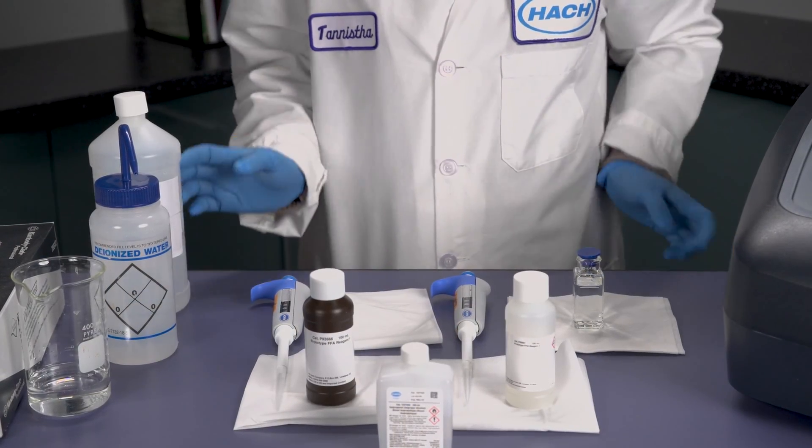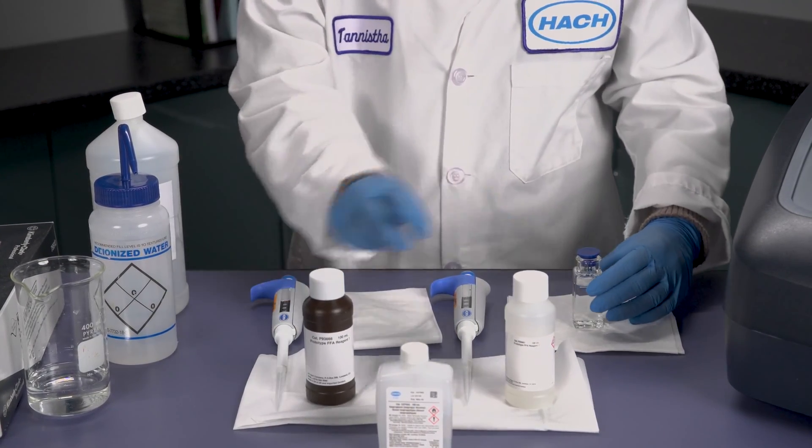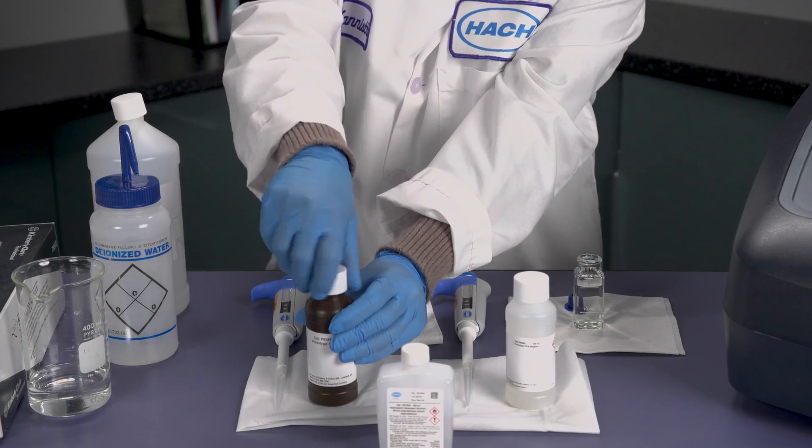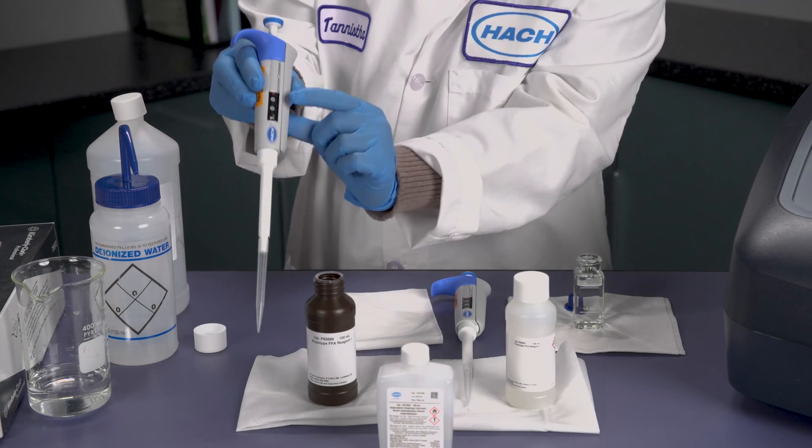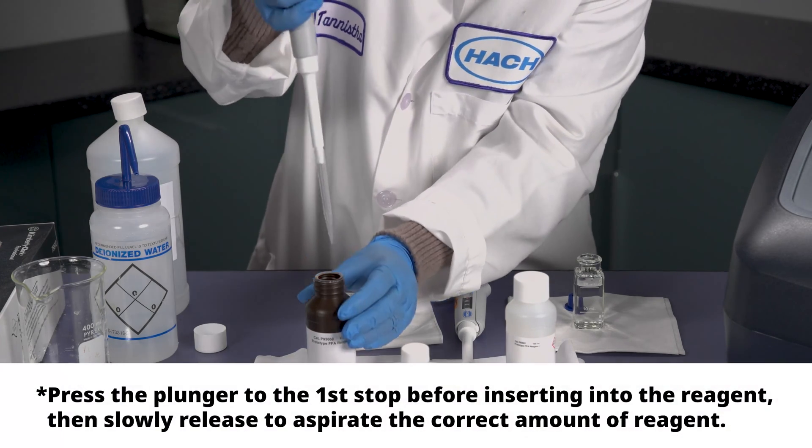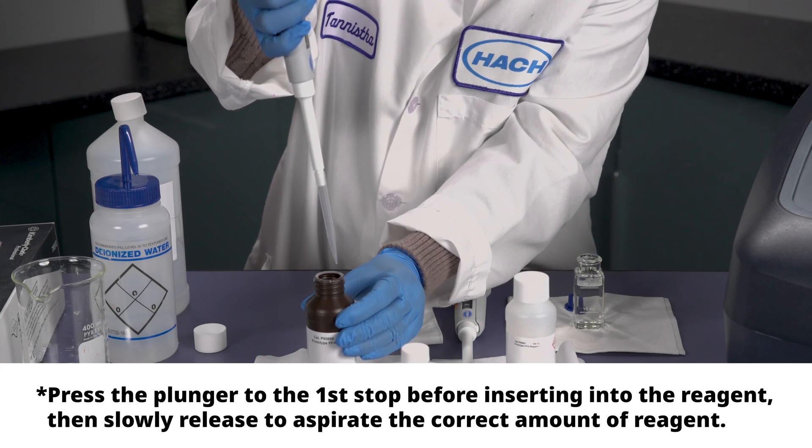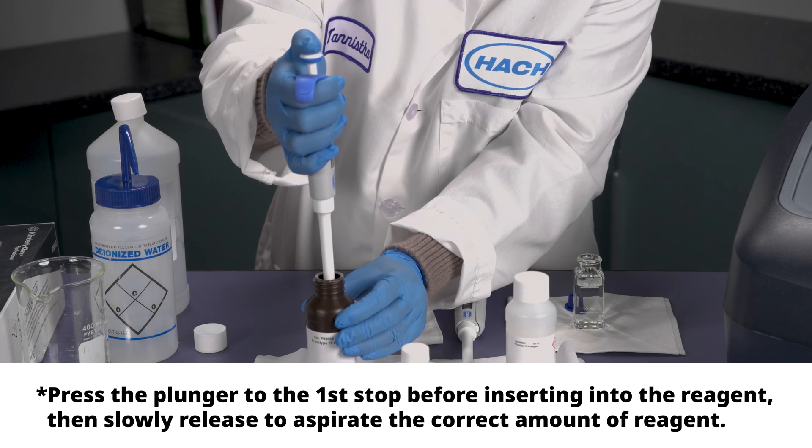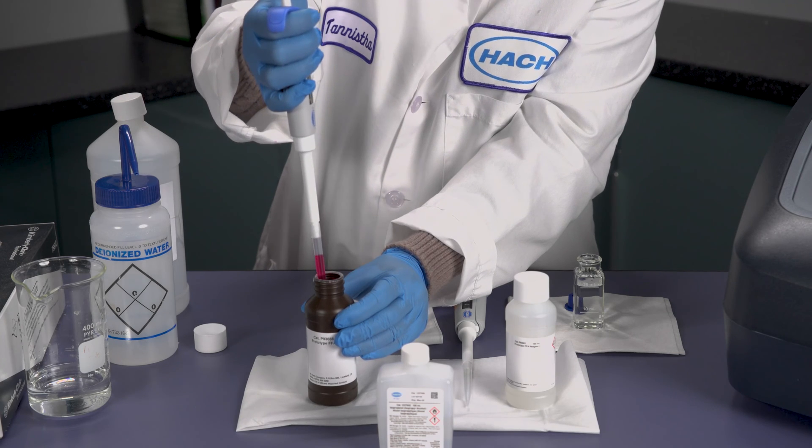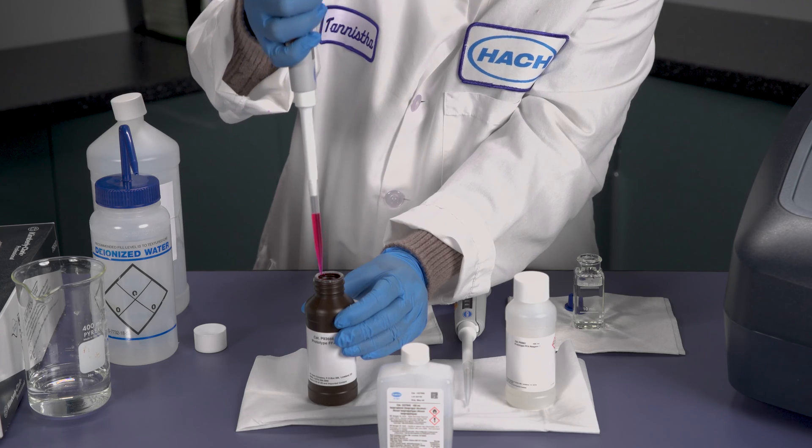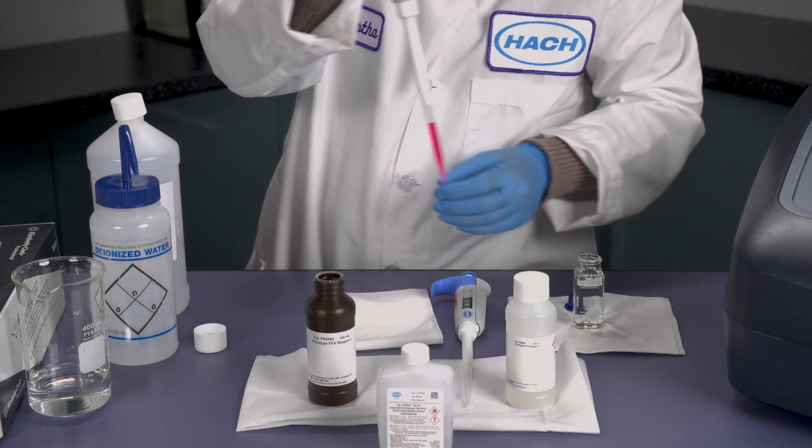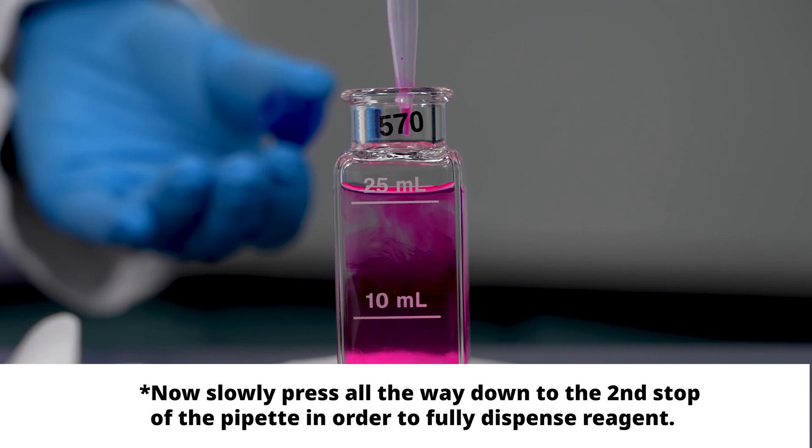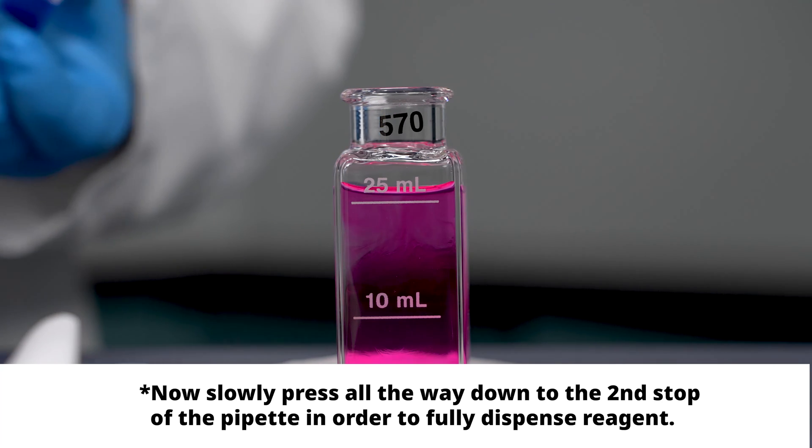First, we're going to pipette film forming amine 1 into the sample cell. Again, it is very critical to properly pipette. Have your pipette at 1 ml. Accurately put it in and slowly depress the plunger, bringing up the reagent very slowly, keeping it vertical, and then accurately transferring to the sample cell. Take your time and make sure all of the reagent is added.